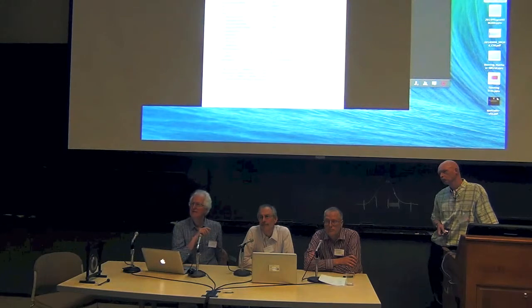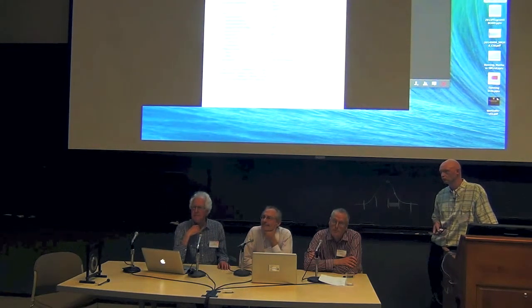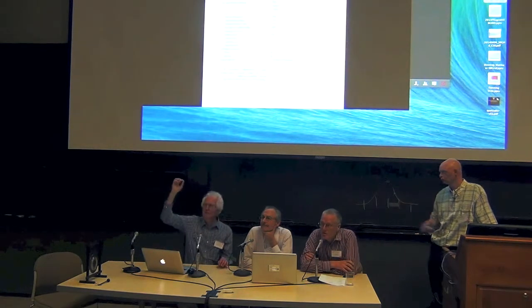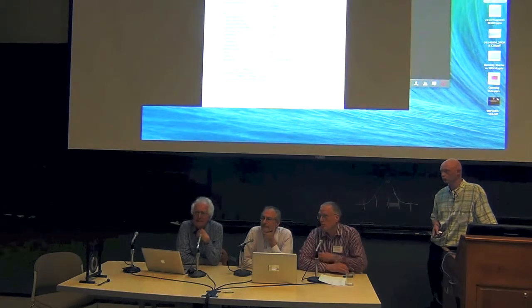The other guy's is much better than mine, but that does not mean that the active site he presents is better than mine. I just want to find a way to compare which structure on that particular site is more reliable. So yes, that's easy: you can look at the electron density correlation coefficient. That is, I think, one good way.